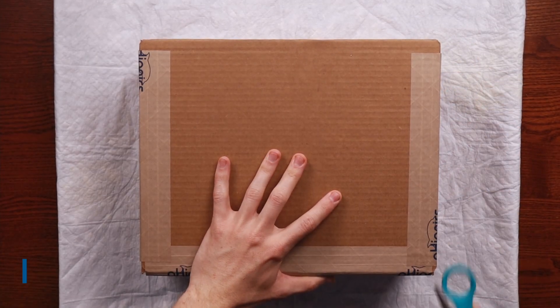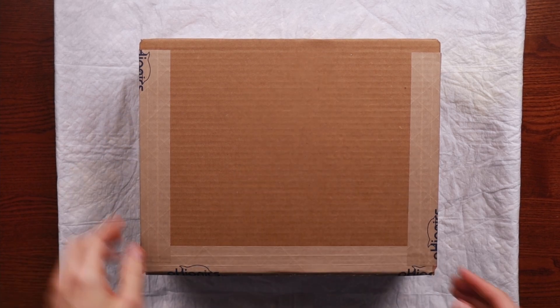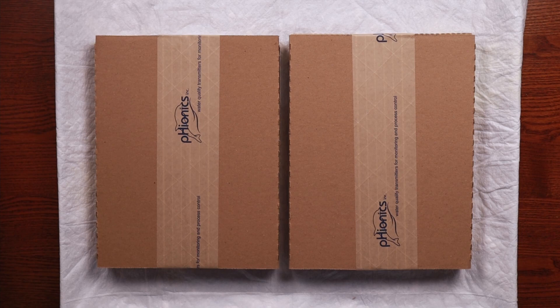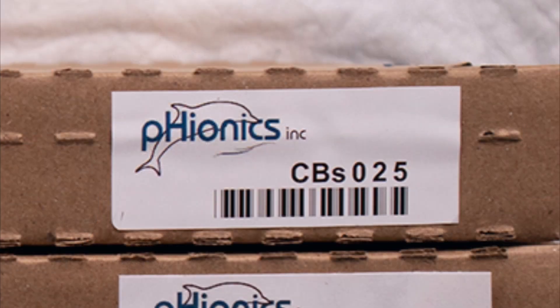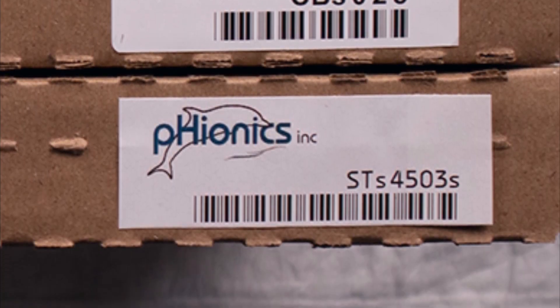Let's start by verifying that you got what you ordered. The packaging will vary depending on the sensor quantity and shipping method, but you'll generally start by opening a box. Once open, you should see two or more smaller boxes inside. Each sensor generally comes in two boxes: one for the cable designated by the label containing CBS, and one for the body of the sensor labeled STS.